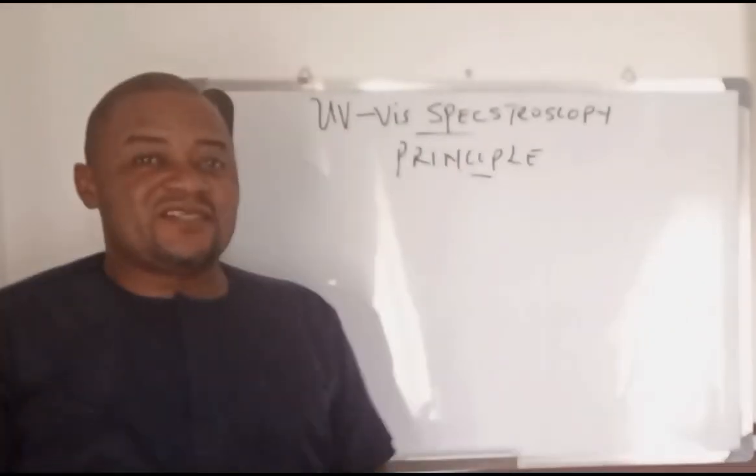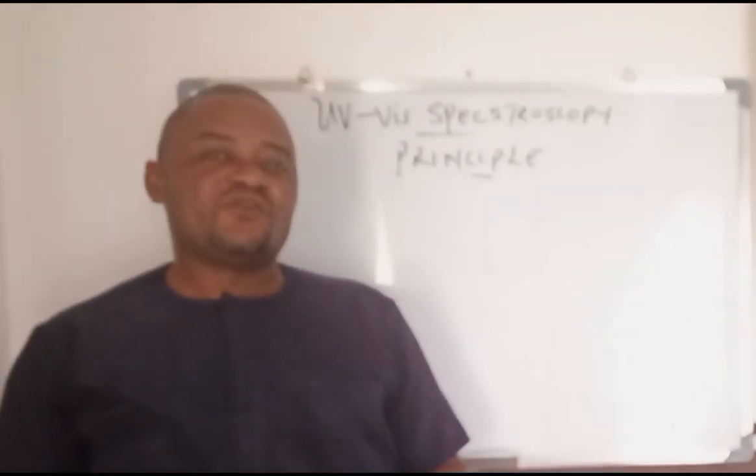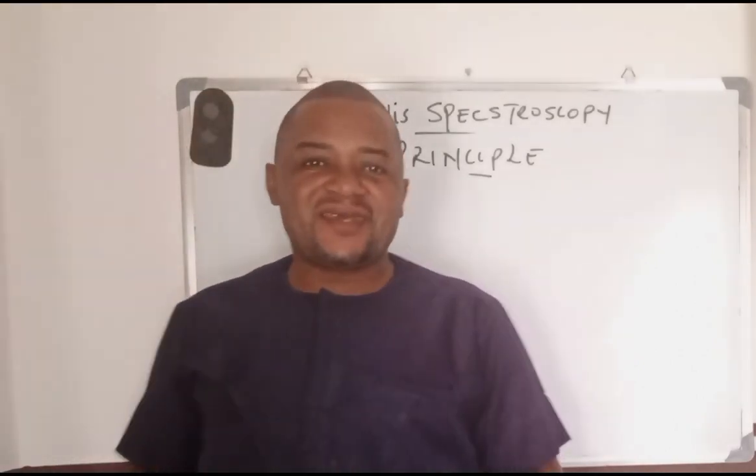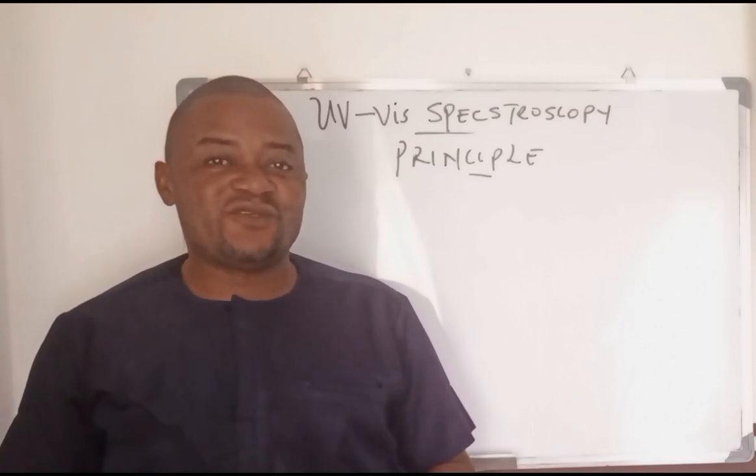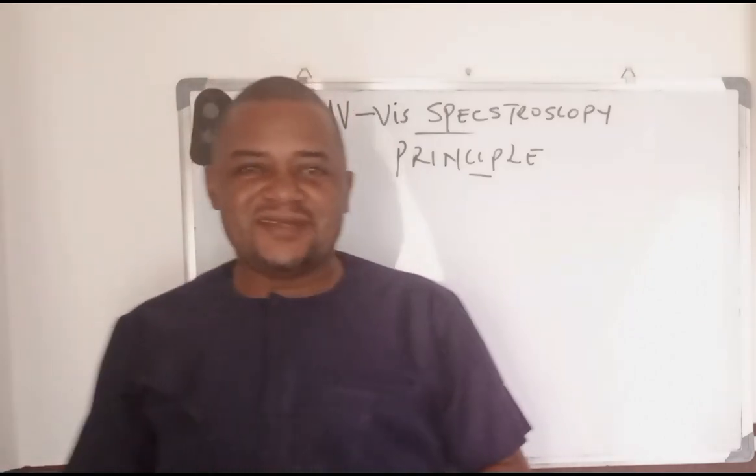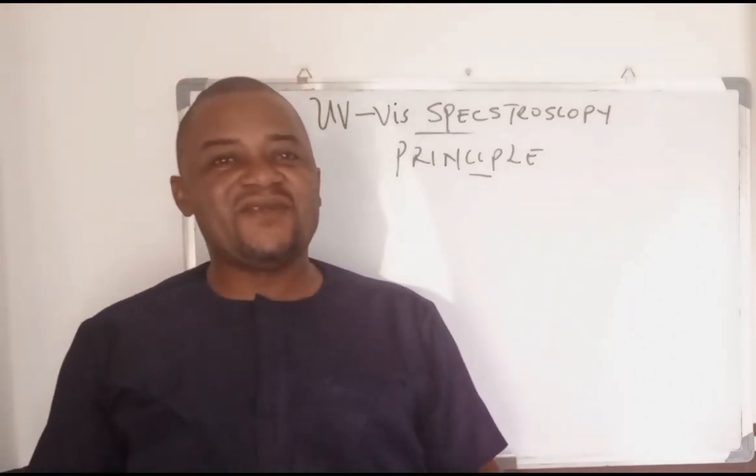And in subsequent classes, we're going to look at the instrumentation, and then we'll look at the application of UV visible spectroscopy.